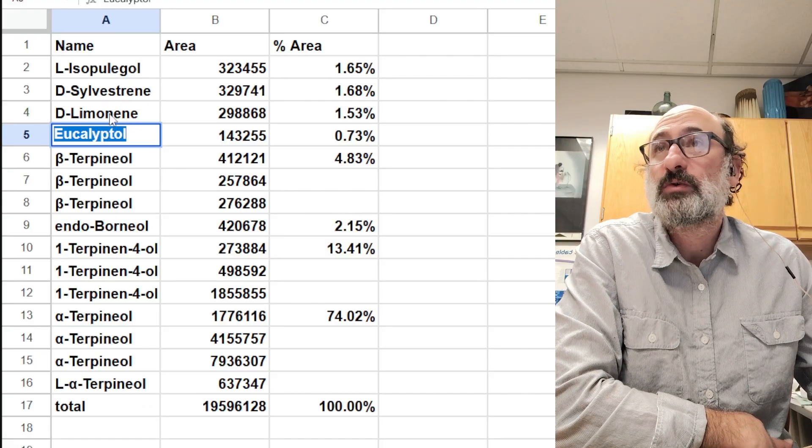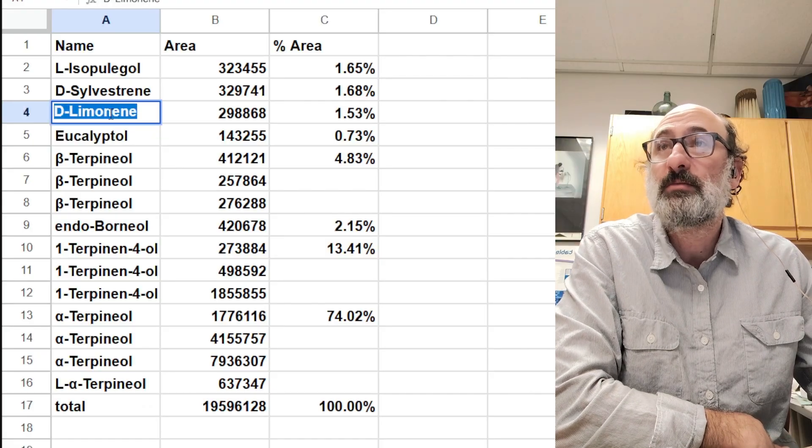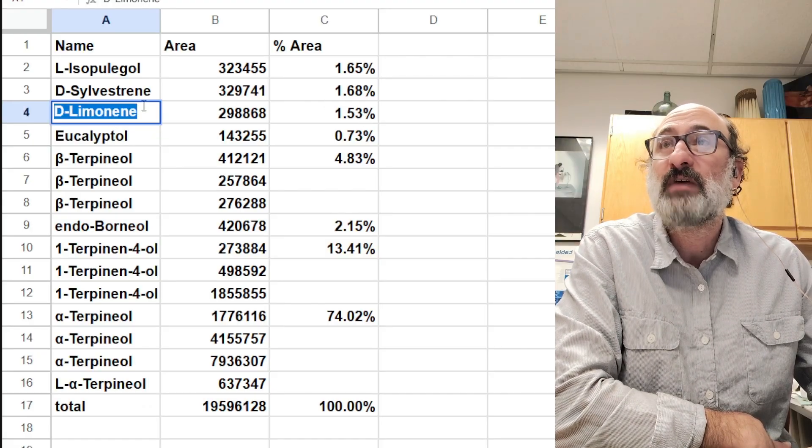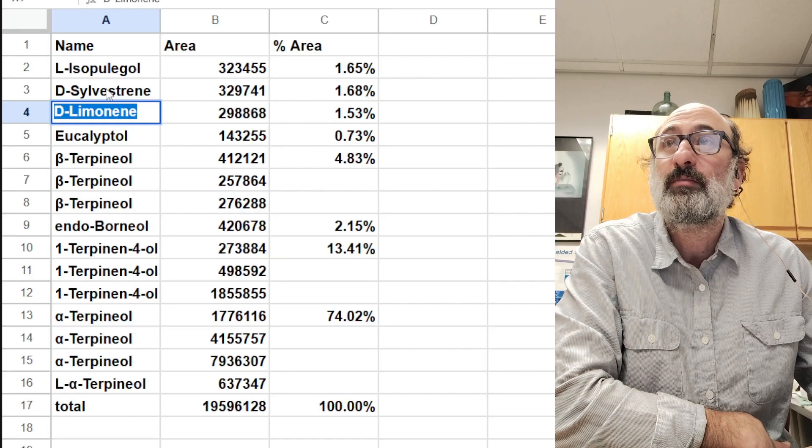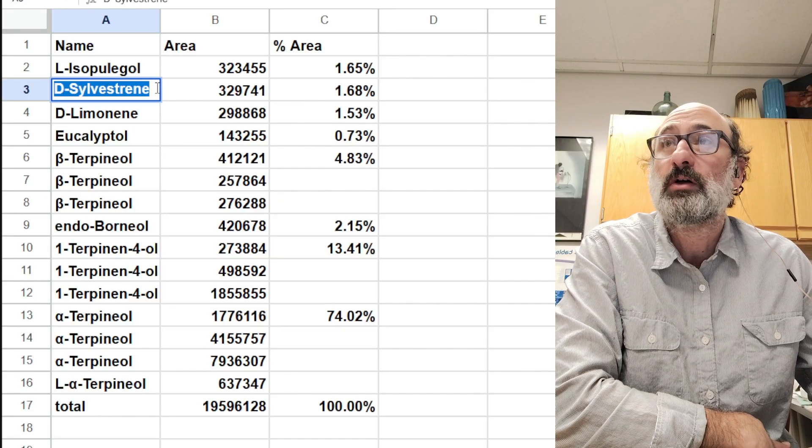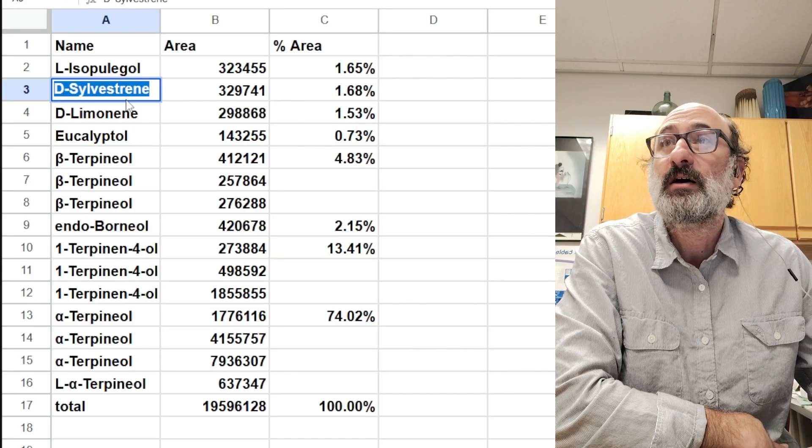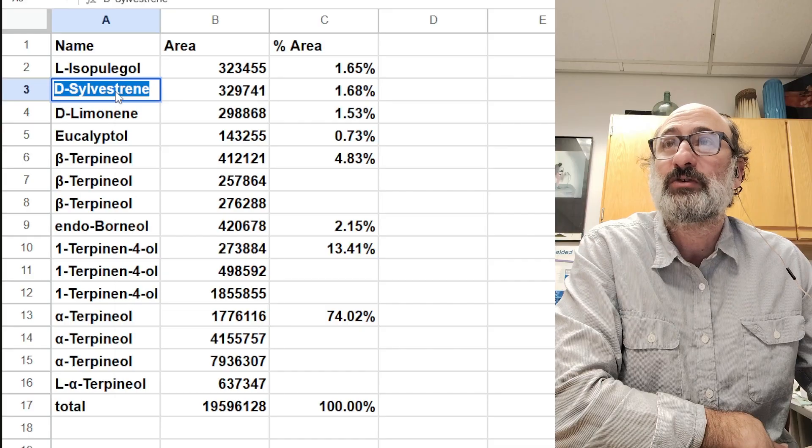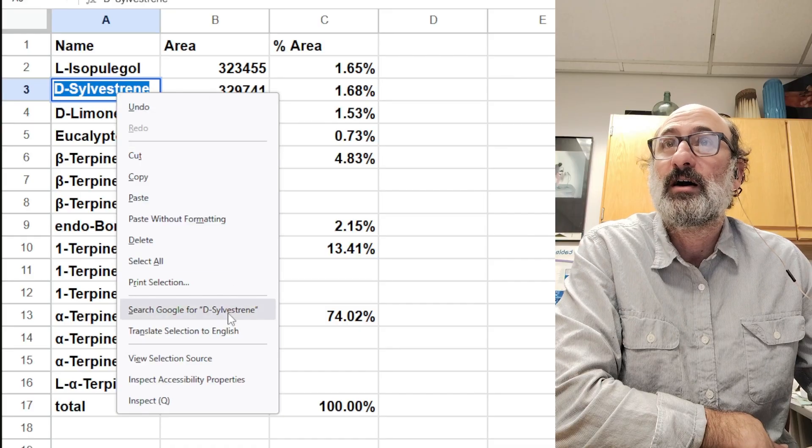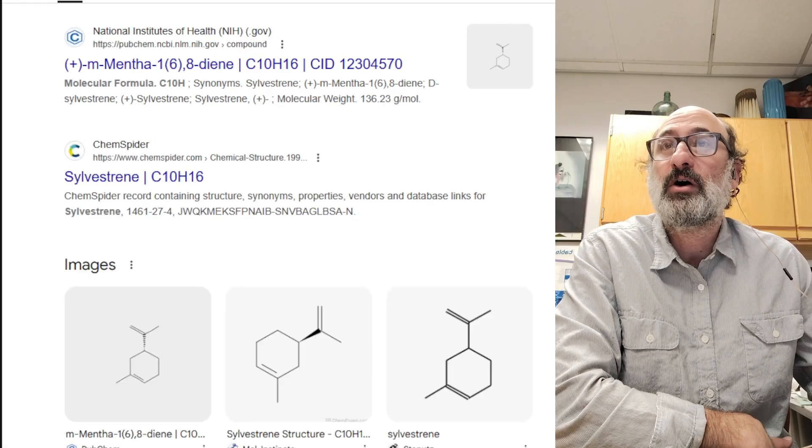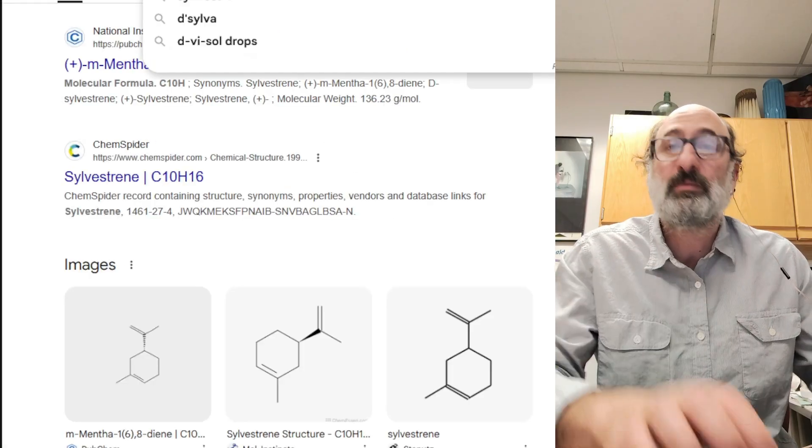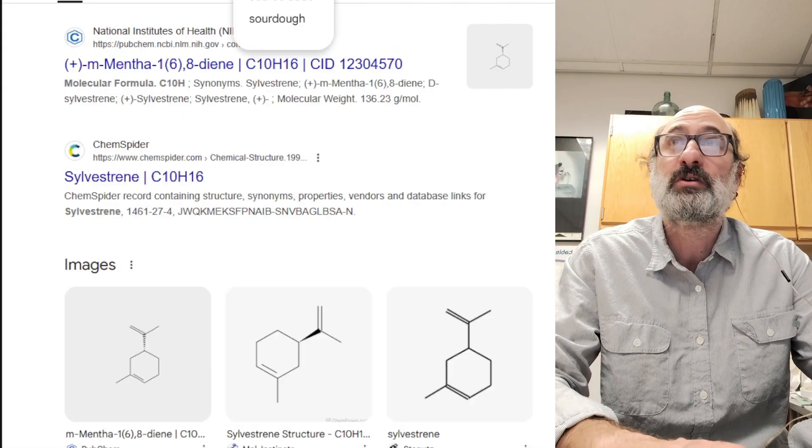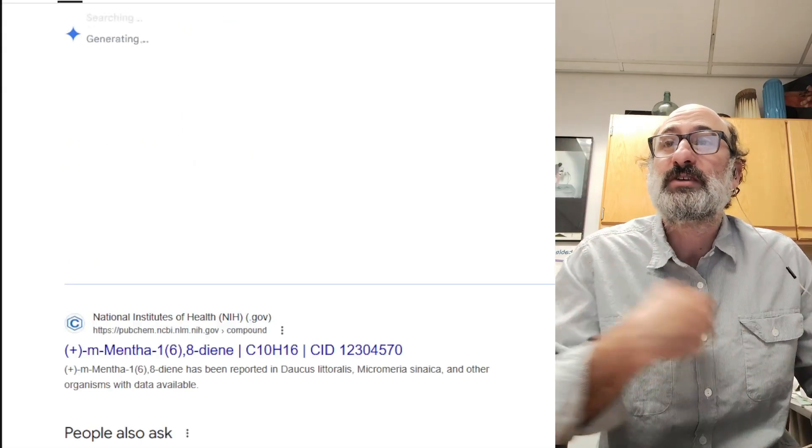Eucalyptol, of course - eucalyptus, limonene with very small amounts of lemon flavor. And then probably the coolest molecule I'll find is this sylvestrene.